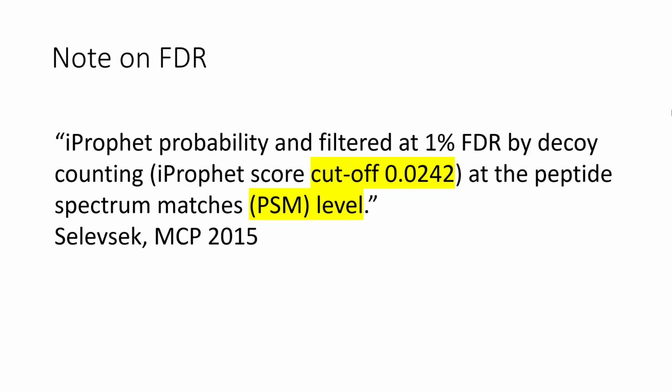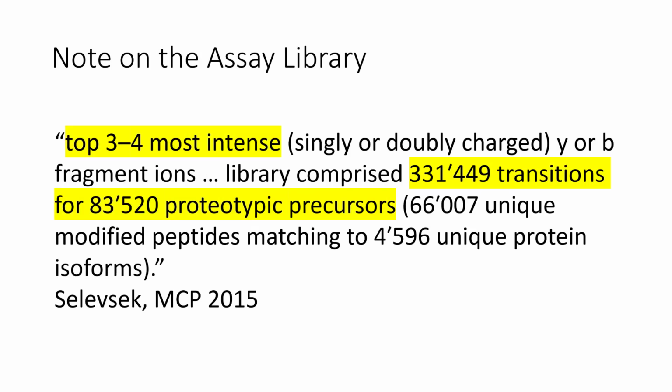So they're in the library; they may not be the greatest, but you probably won't find them either. So it's just a library, and now you have to prove that stuff's in your DIA. I think that's a little bit too cavalier, but anyway, they weren't making real scientific conclusions.